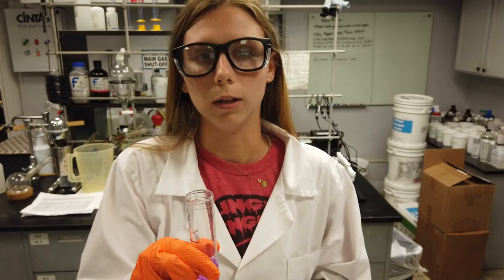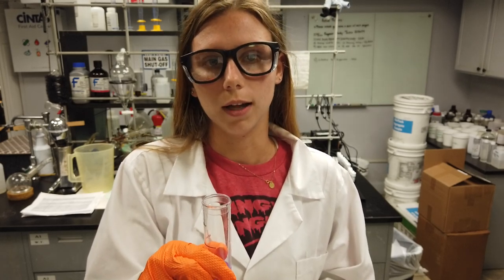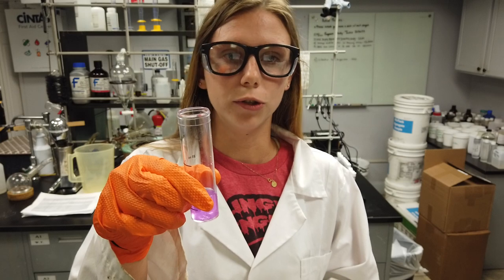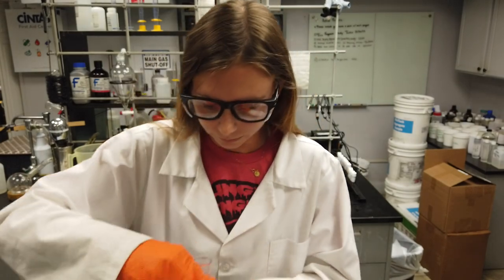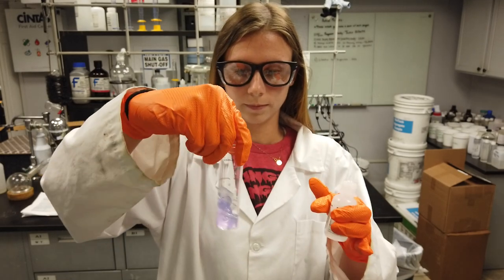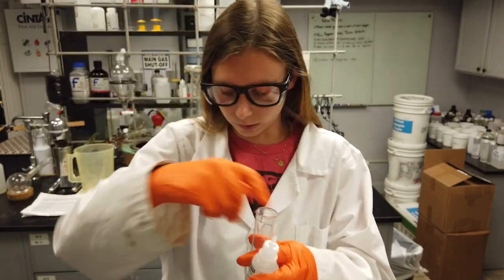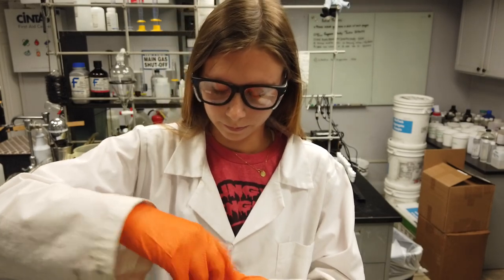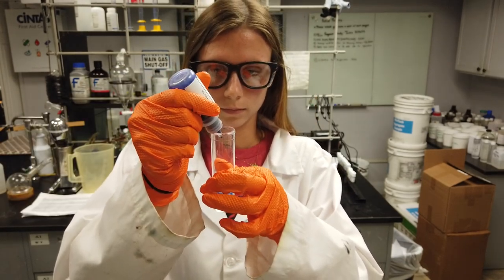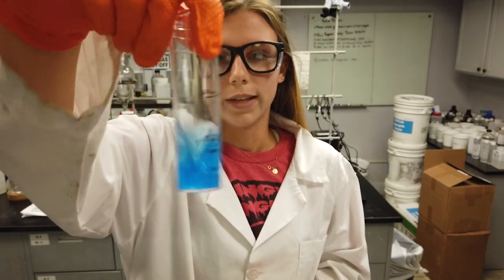If the sample does not remain colorless like this one, add sulfuric acid 5-5 normal one drop at a time until the sample turns colorless, then add 2 drops of the toluidine blue O-indicator. Add 2 drops of sulfuric acid. The sample will now be blue.